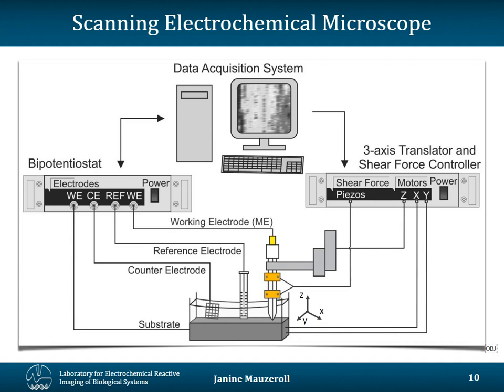And then one of the key features of scanning electrochemical microscopy is the fact that you can acquire reactive imaging of the surface.